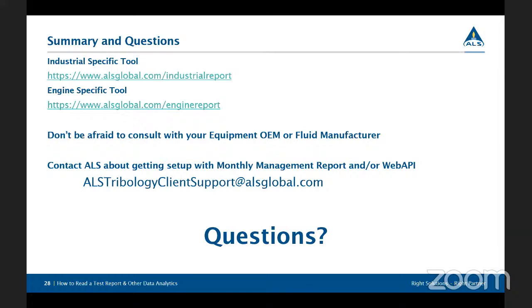So Jerome, through our Webtrieve site, if you have your equipment uploaded into our database, you can select 20 to 40 different sample points. You can hit submit all at the same time, and it gives you 20 different rows, and you can quickly type in how many hours are on the fluid, whether or not it was changed, and then submit them all at one time.